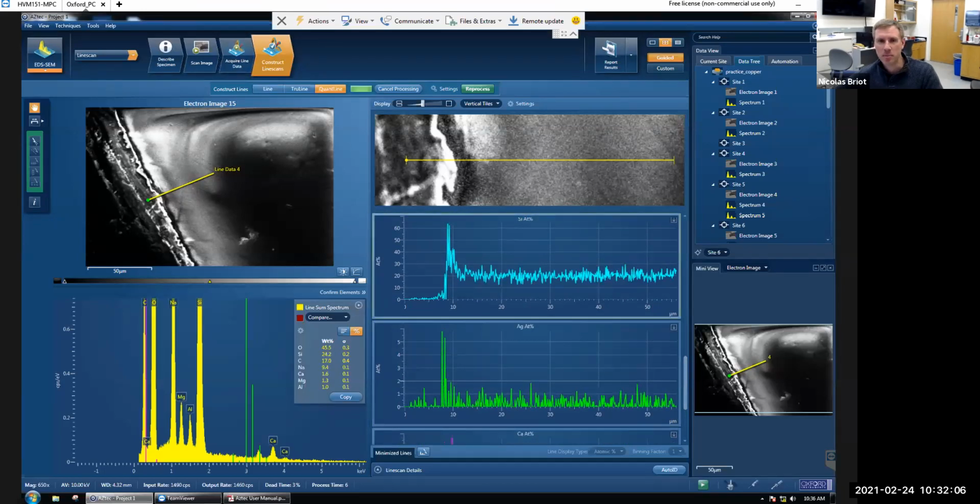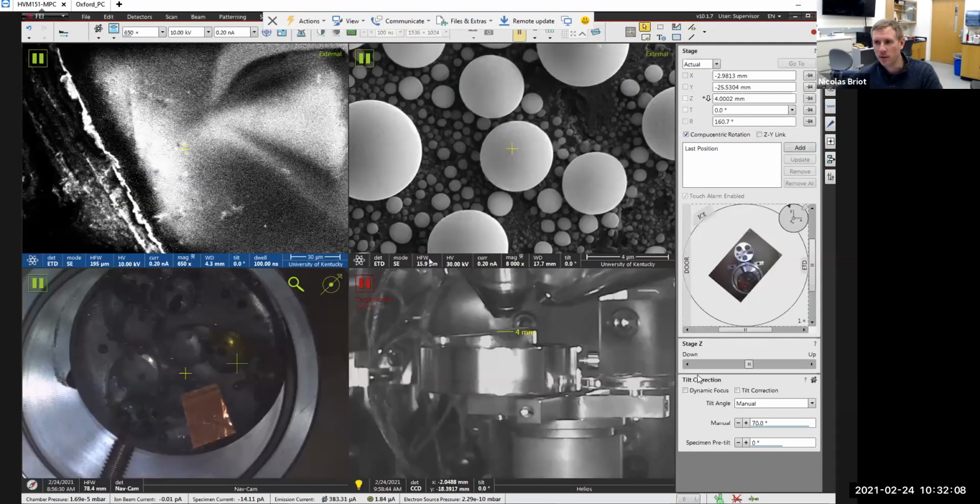How about the other two samples on the holder? I mean, on the puck. This one and that one. If this is mount 2, one of them is potassium, so it could potentially have potassium, and then the other one is, well, they all have potassium actually.